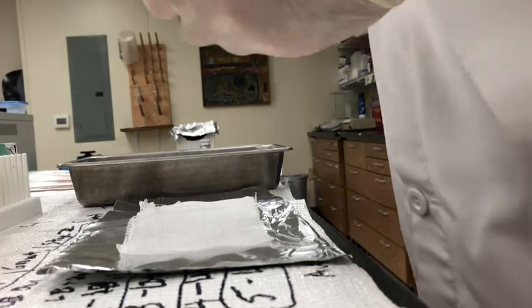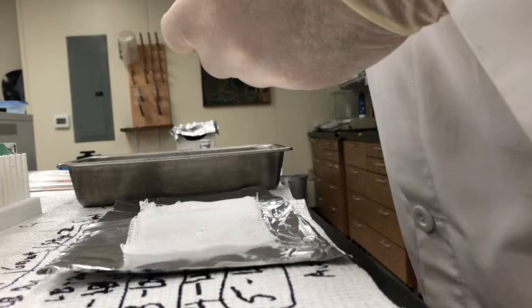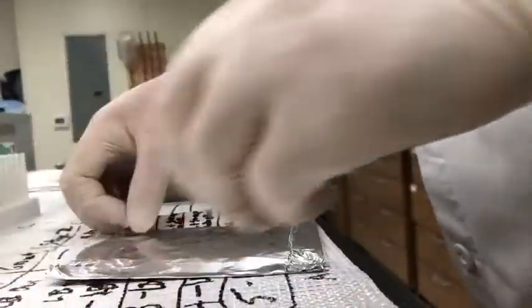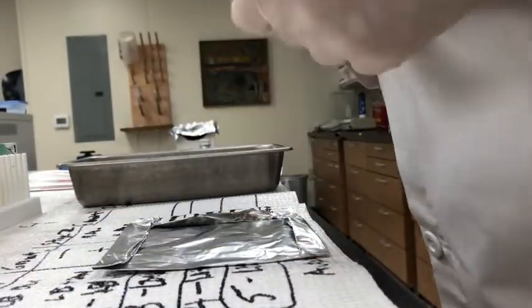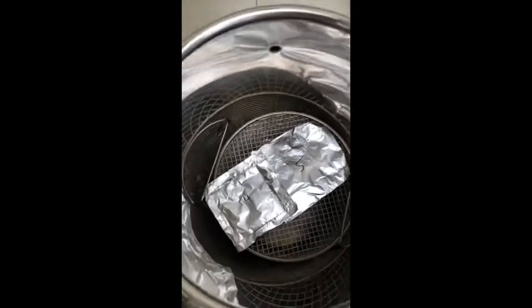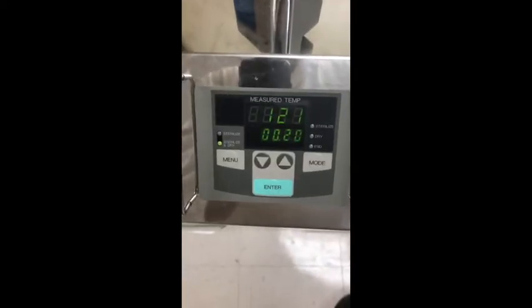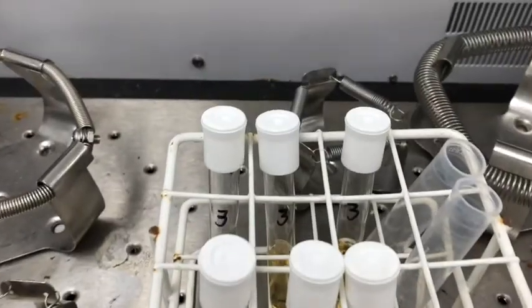Plastic in autoclavable pouch with cheesecloth and then wrapped up in tin foil. Folded these things up, labeled them appropriately, and then we get to put them in the autoclave. After the autoclave, we put them in the shaker overnight.